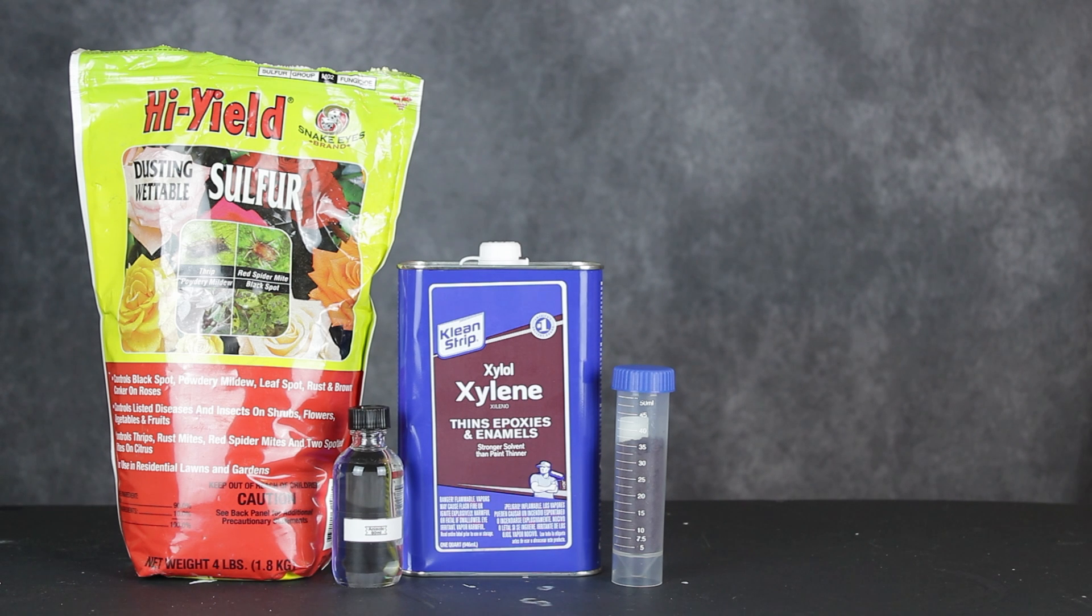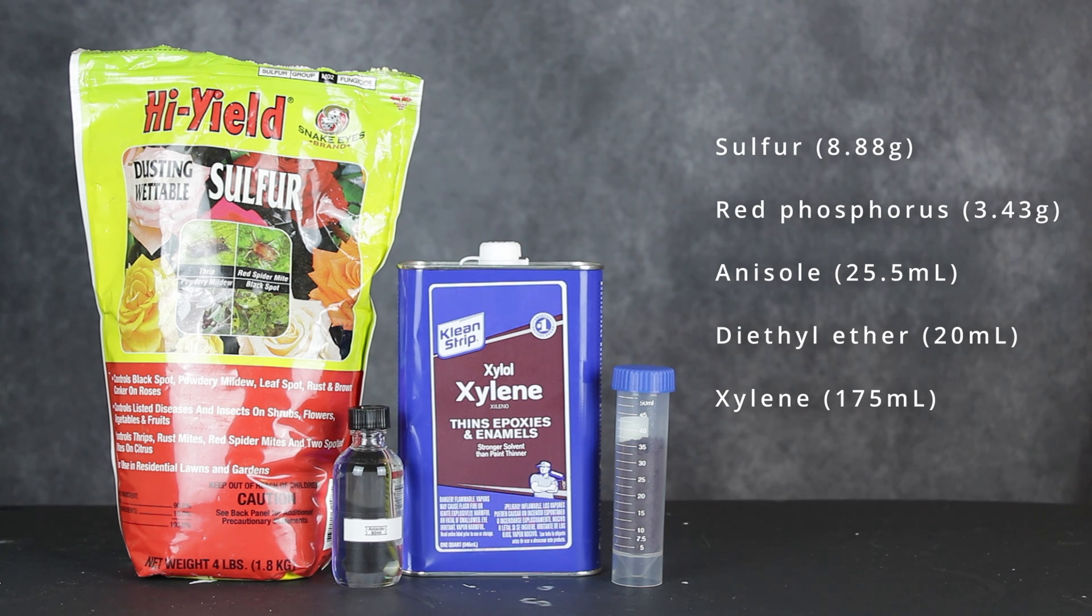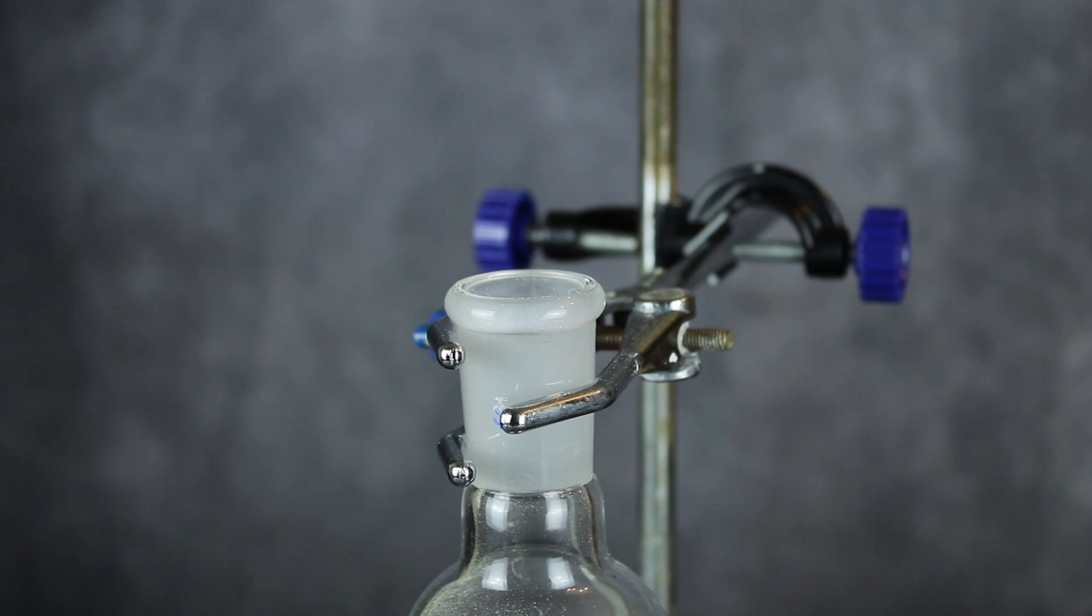To get started, I obtained the following reagents: sulfur, red phosphorus, anisole, diethyl ether, and xylene. Our first task in this endeavor is to synthesize phosphorus pentasulfide, and for that, we'll only need the first two ingredients.